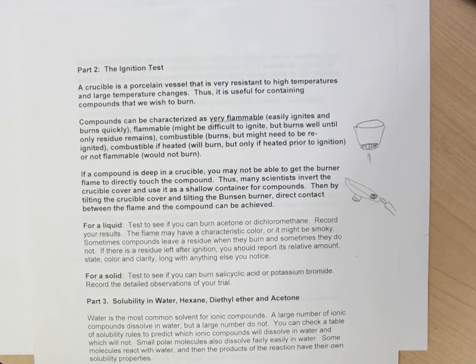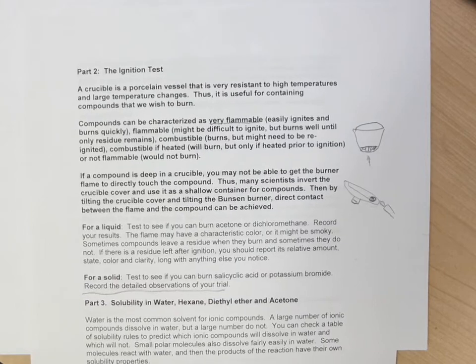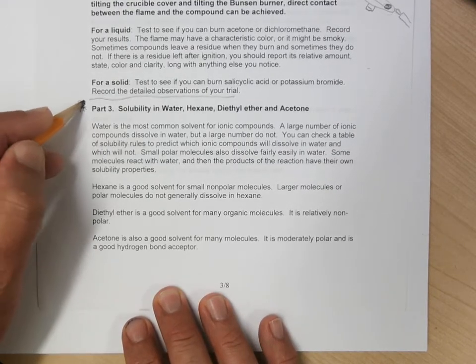they were there. So in this lab we would test to see if we could burn acetone, dichloromethane, salicylic acid, and potassium bromide, and we want people to record detailed observations. I may later in the lab, just because I really like doing this stuff, try to film some of these ignition tests. If nothing else, I will definitely be describing what I would see if I tried to burn these compounds. Alright, and part 3, very, very important if you want to work with compounds.